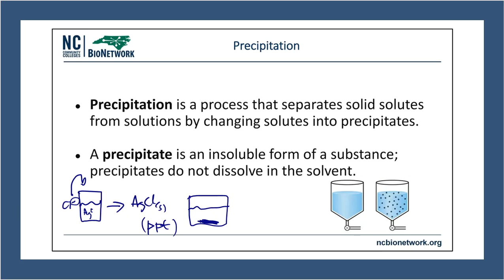So precipitation is going to play a role in the bioprocessing manufacturing line, but also in the waste disposal as well, because again, if we can be creative, we can use precipitation to gather things and separate things, so that way we can limit the waste that we're generating. We can make smaller volumes or quantities of stuff that have to be processed. Or at the same time, maybe it's what we need to gather. Maybe that's what we need to keep. Maybe that's what needs to be separated off and kept, so that we can do further purification down the manufacturing line. And if so, that's okay.